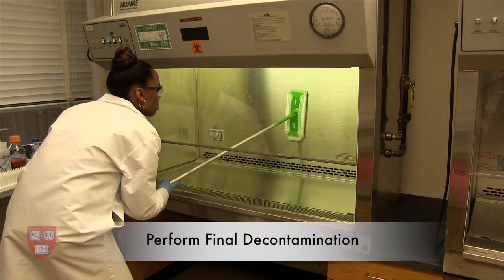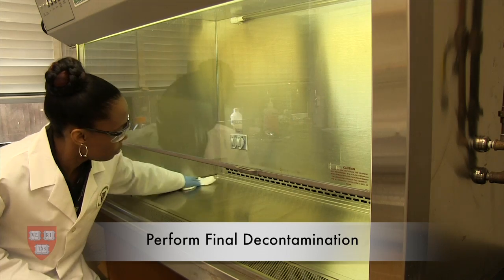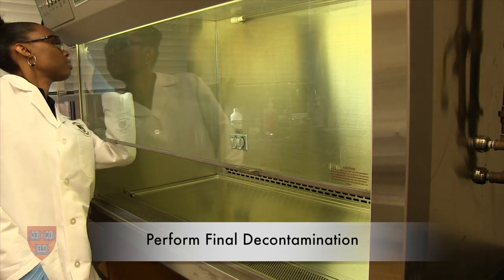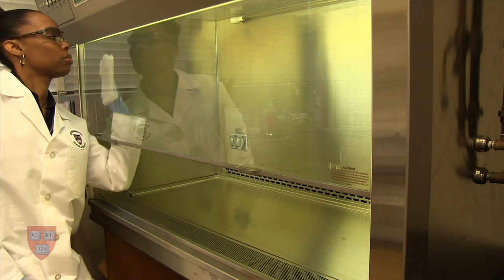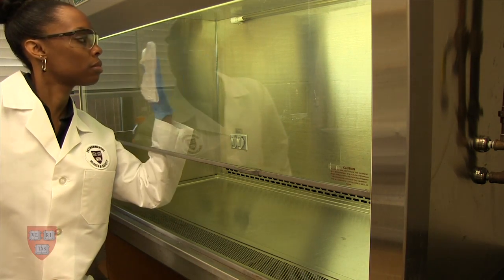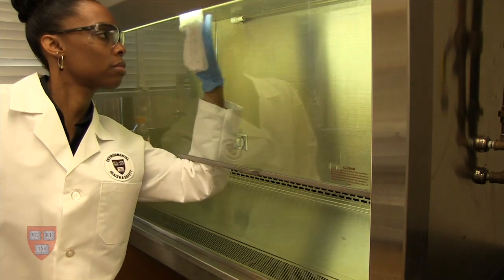Perform a final surface decontamination of the workspace, sides and back, and the interior glass surface. Remember, if you have used any type of biological material in the BSC, then all surfaces need to be decontaminated with a disinfectant appropriate for the materials used.